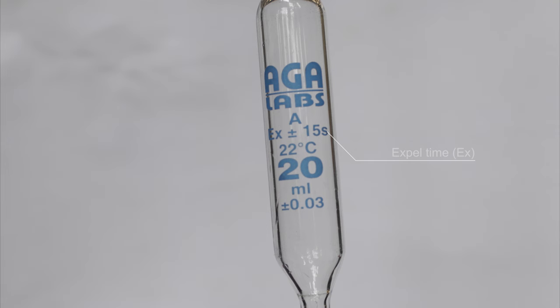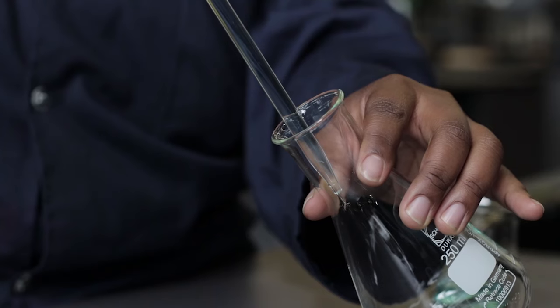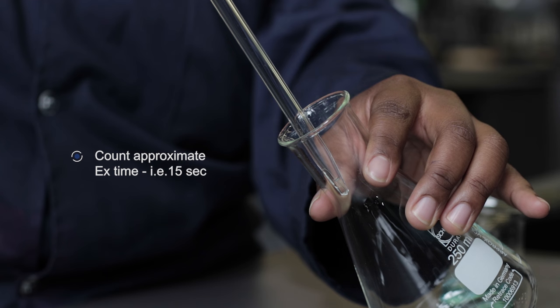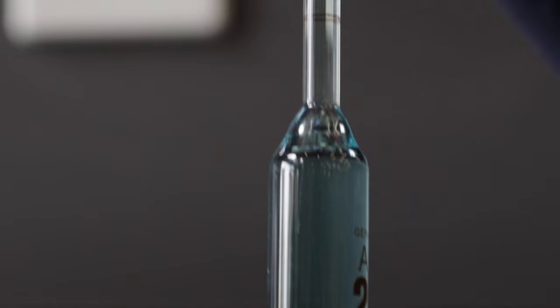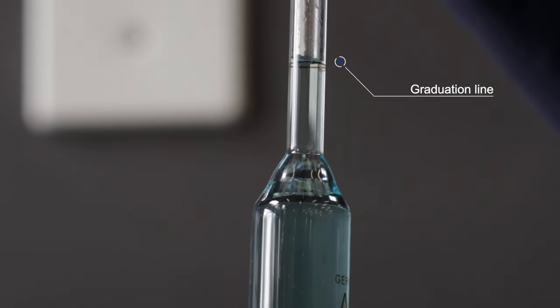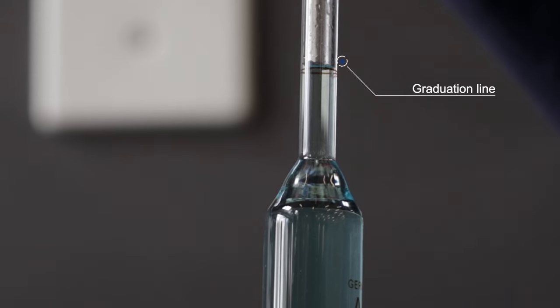This value indicates the expel time. Once all the solution has been expelled you will need to continue to expel for approximately this period of time to ensure that you have delivered all of the liquid. A single graduated ring indicates the calibrated volume for example 20.00 millilitres.